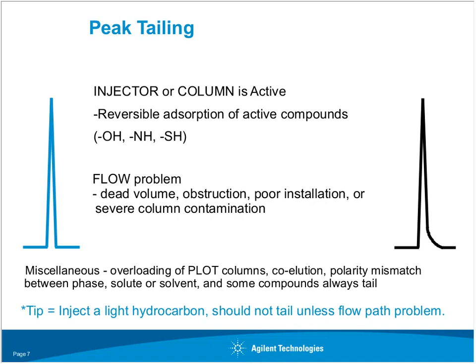So when you're going to install a column, and as I mentioned, we covered this in quite some detail in the installation and column selection e-seminars, it's really important that you take the time to do it right. So if you do have a problem, when you call tech support and we ask you to check the installation, you don't say, oh geez, I don't want to go through that again. Those small parts, they're hot. But please, when you change a column or trim the column, take your time and do it right, so we don't have to go back and check it again.